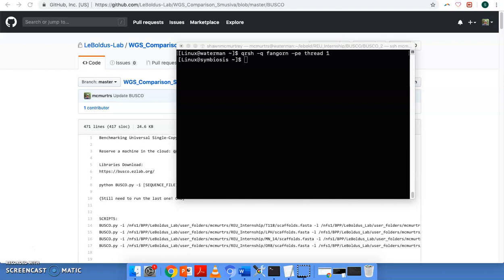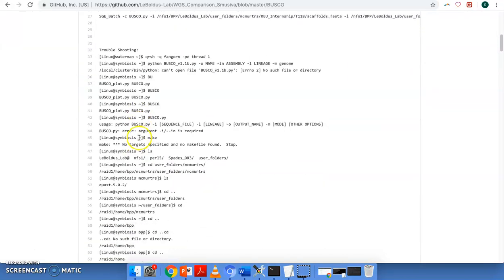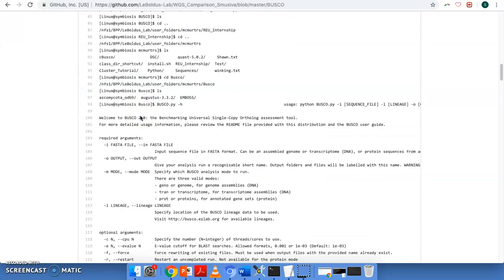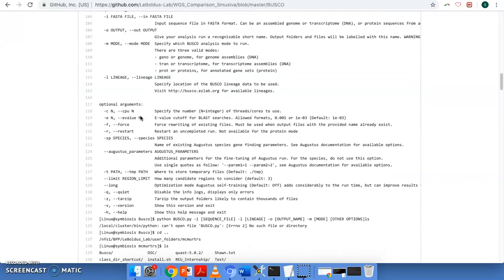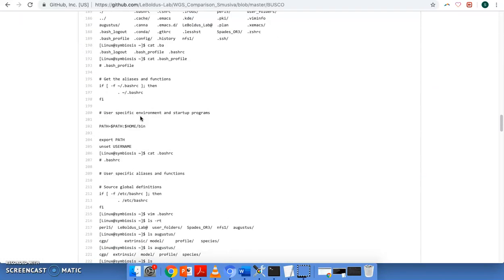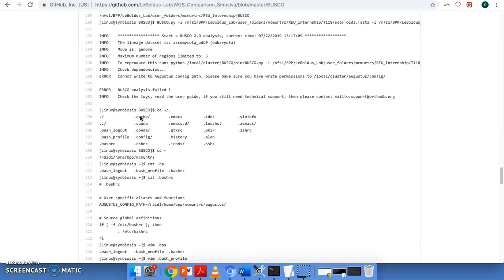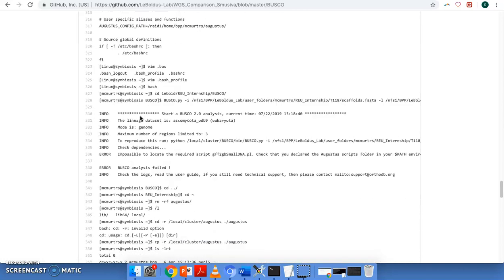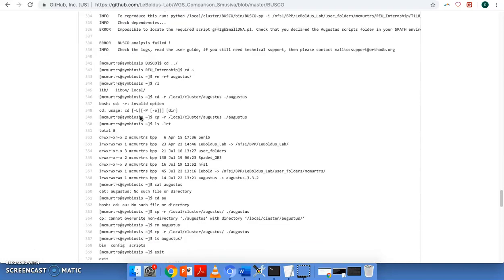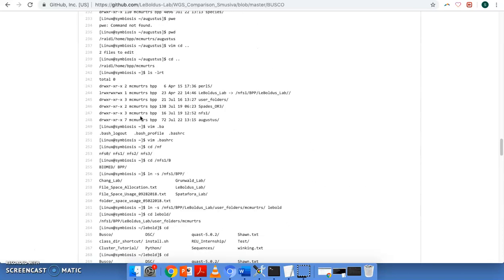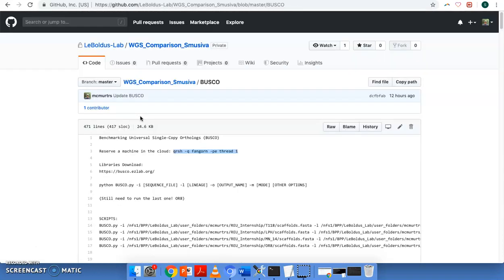So there's a lot of things that can go wrong, and so if you do have trouble, I've added this troubleshooting portion down here. Javier helped me troubleshoot through a lot of this. I wouldn't have been able to get this done without him. So if you can't figure it out at first, don't get frustrated. It is a pretty complicated process. But hopefully this video will help and hopefully the tutorials will help.